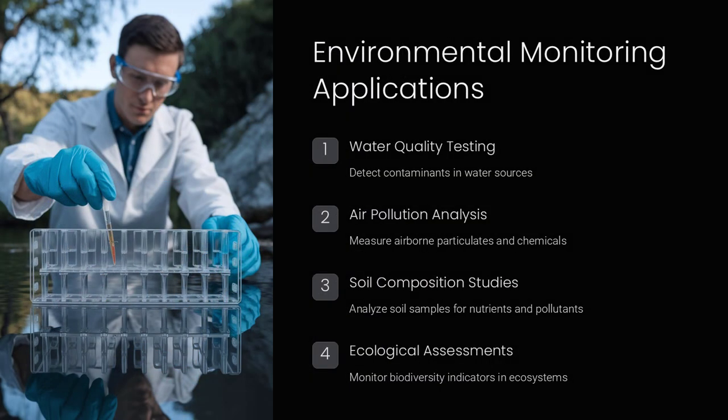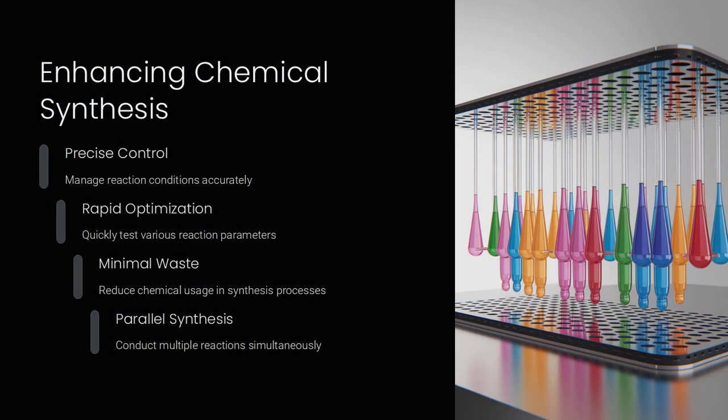In a research laboratory, digital microfluidic devices are used to perform PCR, polymerase chain reaction, assays on minute DNA samples, accelerating genetic testing and pathogen detection. It is like a state-of-the-art workshop where a single, highly versatile tool can perform various tasks, from precision cutting to intricate assembly, streamlining the entire production process.